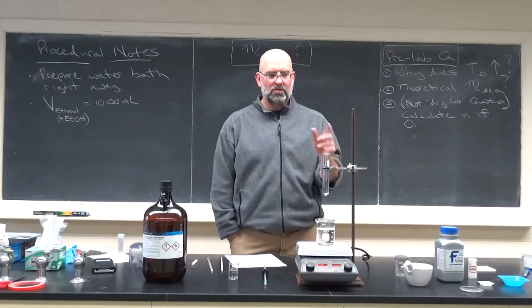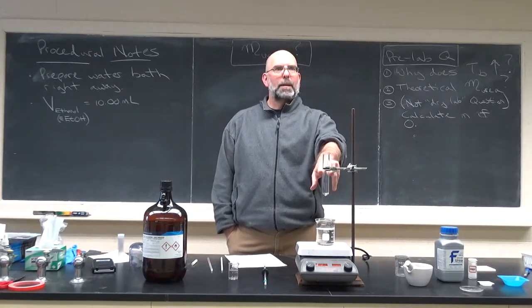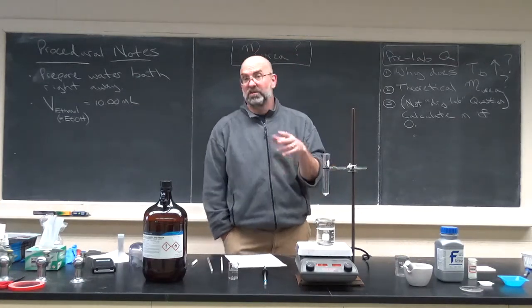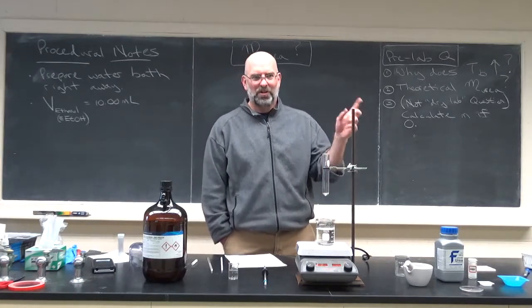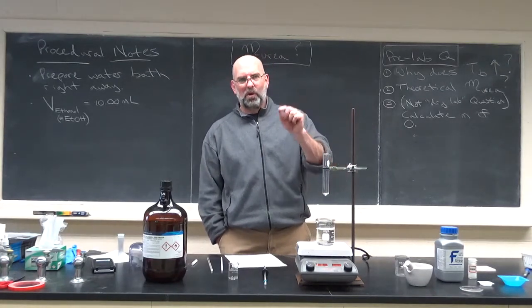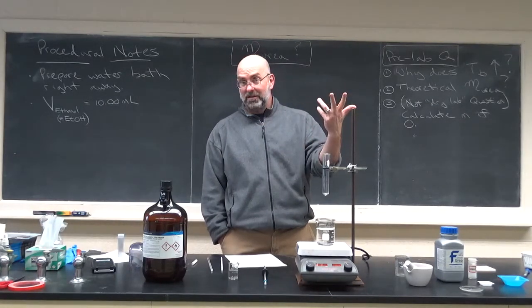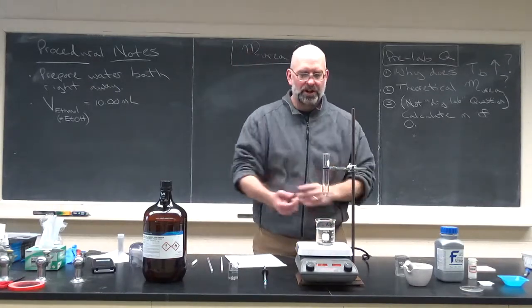But what we don't want to do is lose too much of the volume that we put in here. That's actually a source of error. It's almost impossible to avoid. Okay, so yes, we want to boil the ethanol, and yes, we want to boil the ethanol with the urea dissolved in it, because this lab is boiling point elevation. Okay, so that's what you want to do.